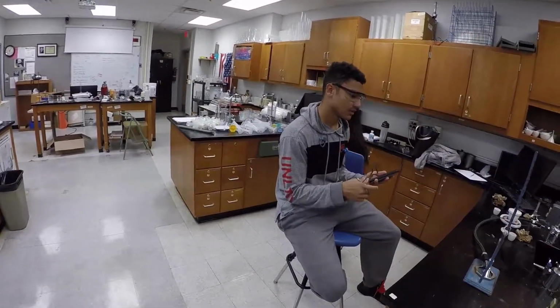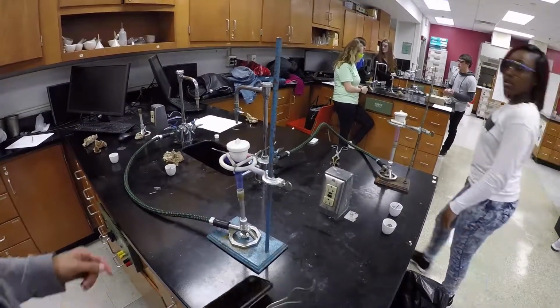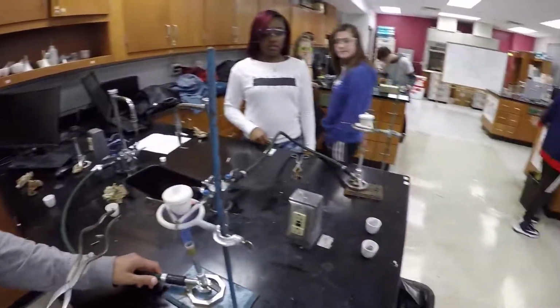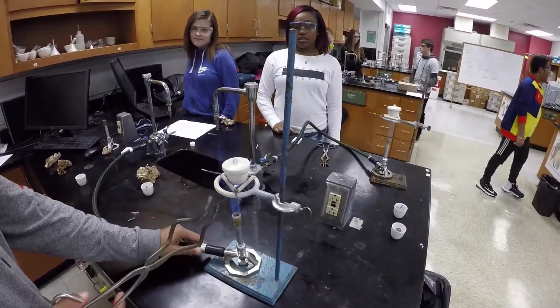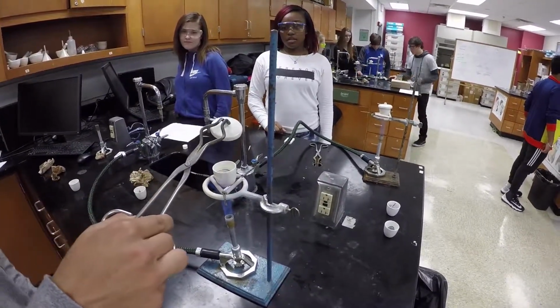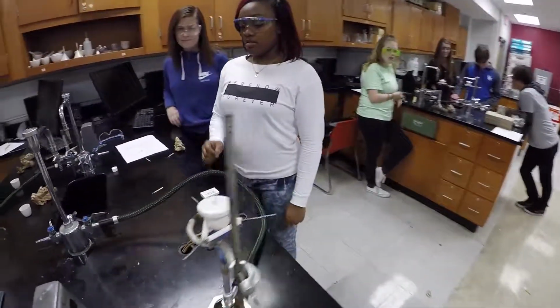Give it about 2 minutes. This has been on for a good 2-3 minutes. All right, take yours off and we'll see if the oxygen attacks it. Now, you can see yours is getting red hot there on the edges. No, keep the fire on there, because once it goes down, it'll stop reacting. Yeah, it's not hot enough yet. Keep the lid on. Yours is getting really hot down the side.